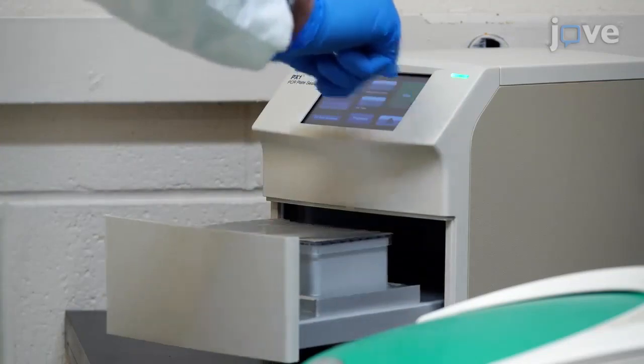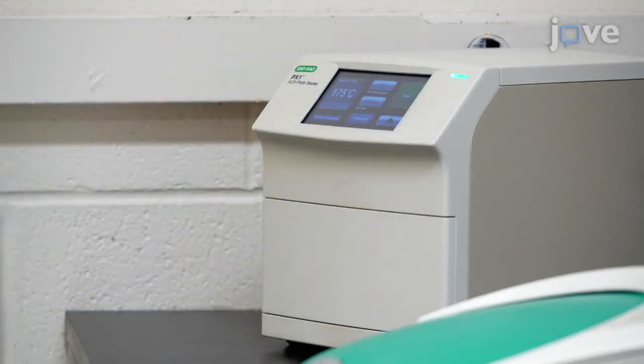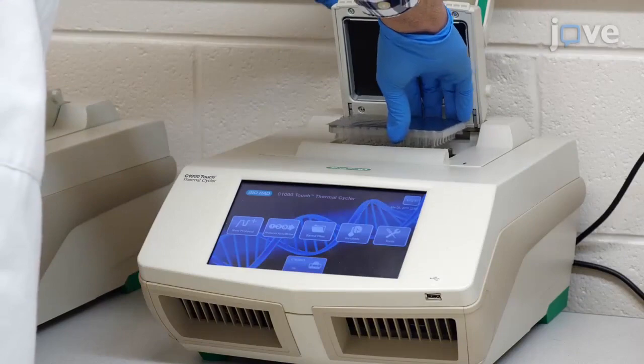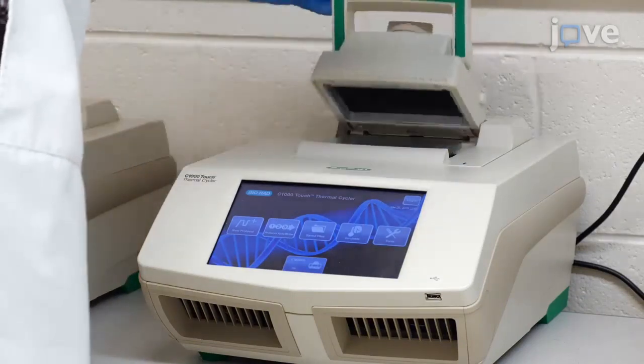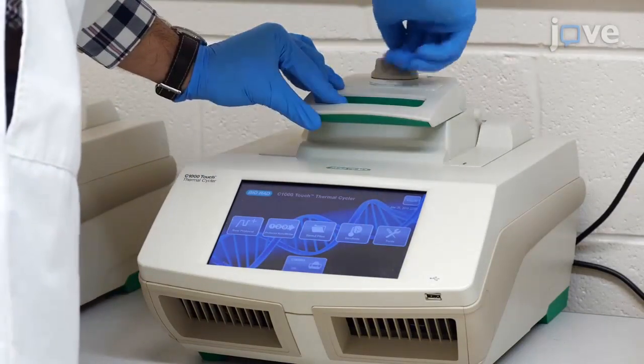The DDTRAP assay provides the ability to obtain a sensitive, robust, and highly quantitative measurement of telomerase enzymatic activity in cells. The ability to run up to 96 samples per run in a medium throughput fashion offers us a great advantage. We can run the controls and replicates for proper statistical analysis on the data collected.